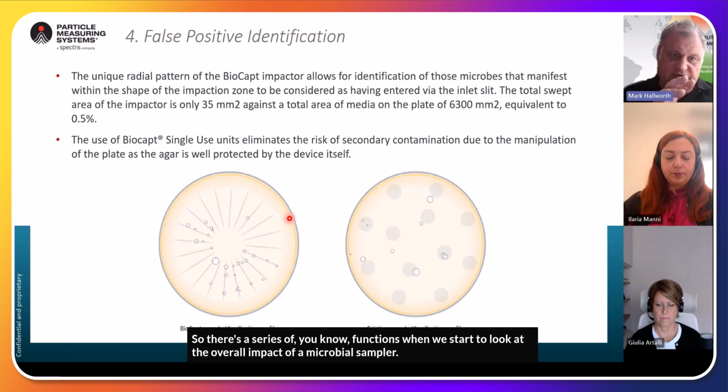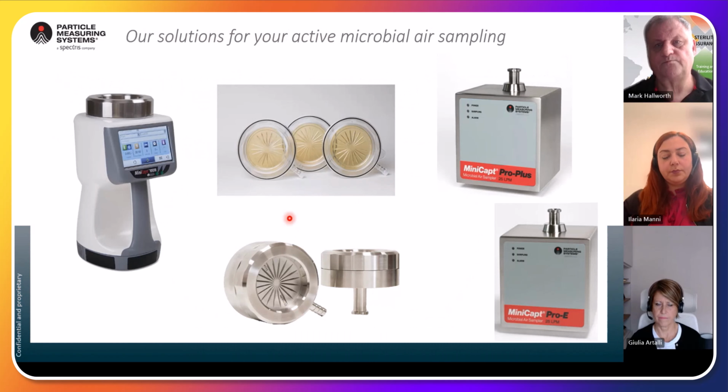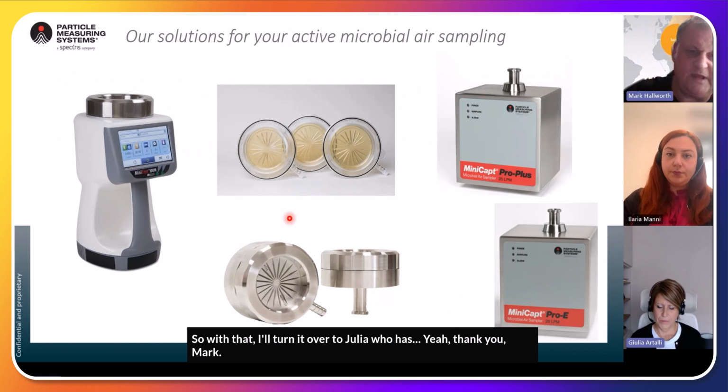So there's a series of functions when we start to look at the overall impact of a microbial sampler. And with that, I'll turn it over to Julia.